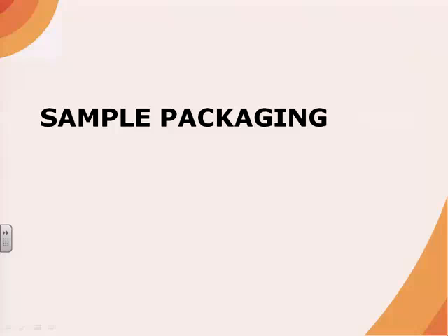After diagnostic samples are collected, they must be prepared for shipment to the appropriate diagnostic laboratory. The necessary sample packaging will be dependent on the agent suspected and the type of samples being sent. We will review basic points to remember when packaging samples. However, additional measures may be required depending on the situation.